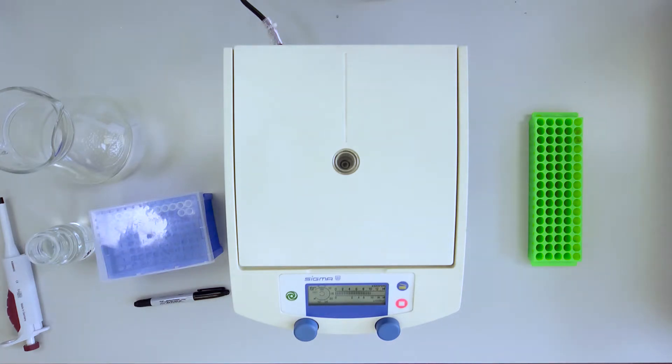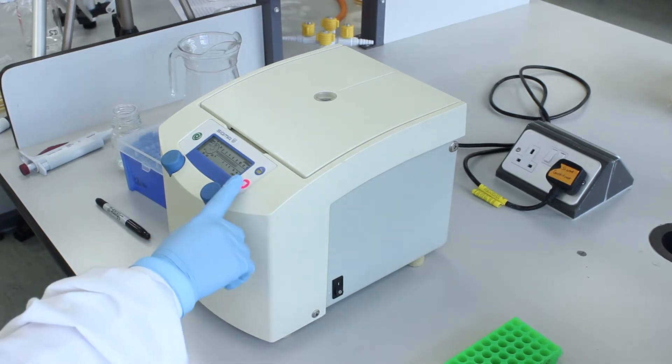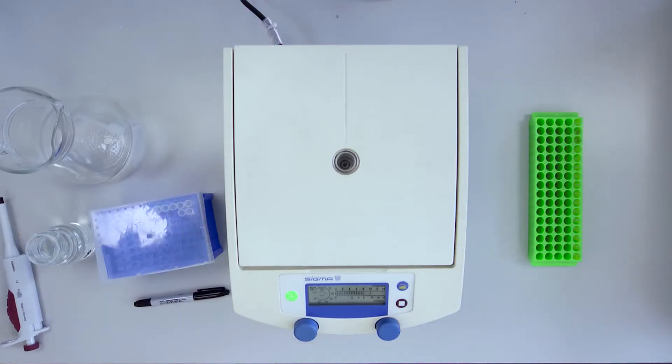When a centrifuge is off balance, it may shake or wobble and emit a loud shrill sound. This can damage the equipment and can also lead to injury in severe cases. If any of these things happen, switch off or cut power to the centrifuge immediately.